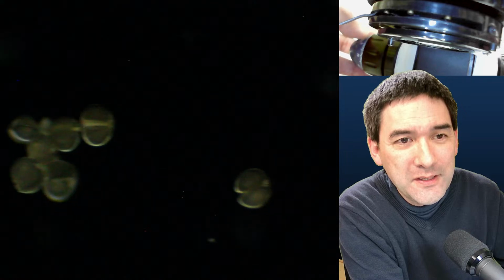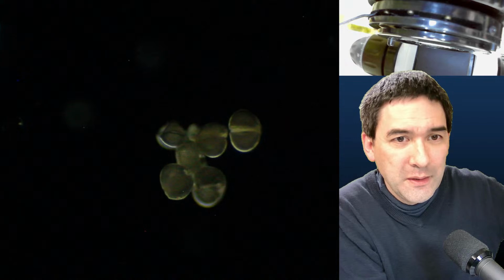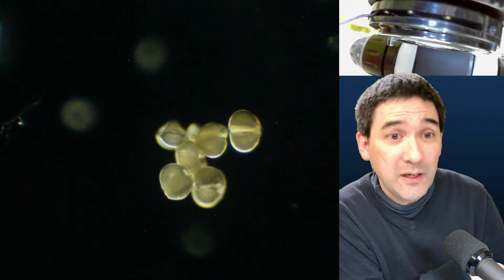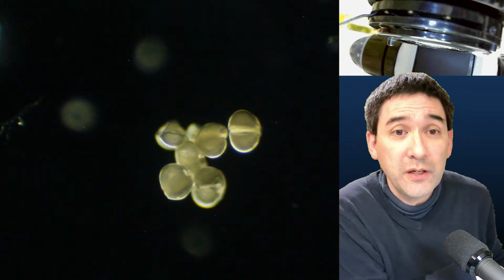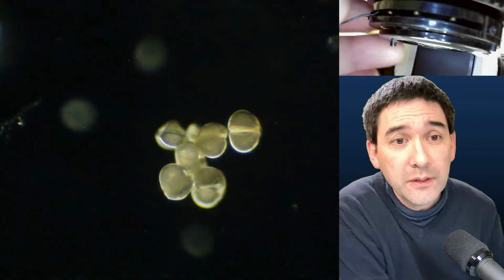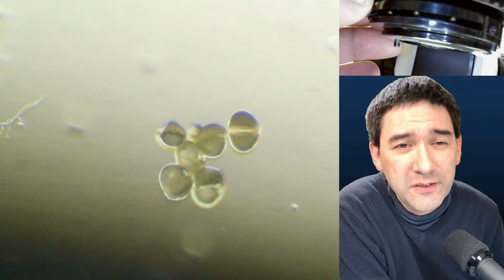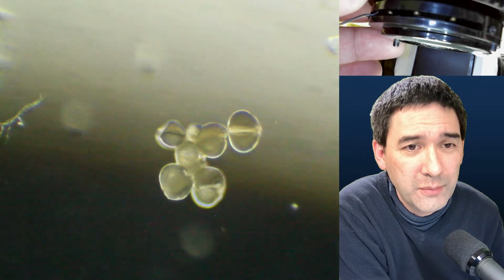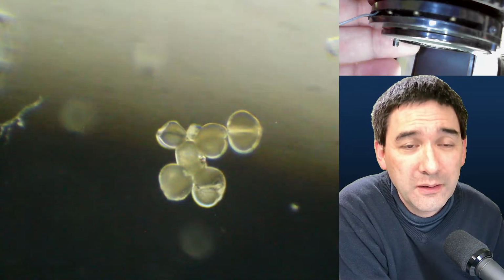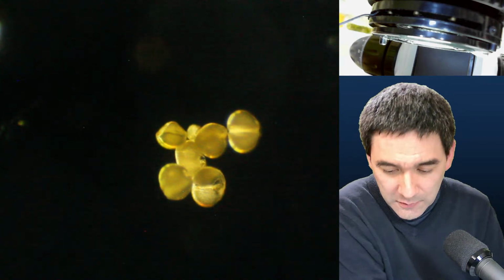So we are now back in darkfield, and I'm going to make it a little bit brighter here. Oh wow, I have to turn up the lamp, of course. These are now the pollen grains in glycerol, or glycerin. And you can again see that, honestly, on camera the effect doesn't look quite as good as when you're looking through the microscope. But again, you can optimize the filters a little bit. But that's basically how it looks. The glycerol one.